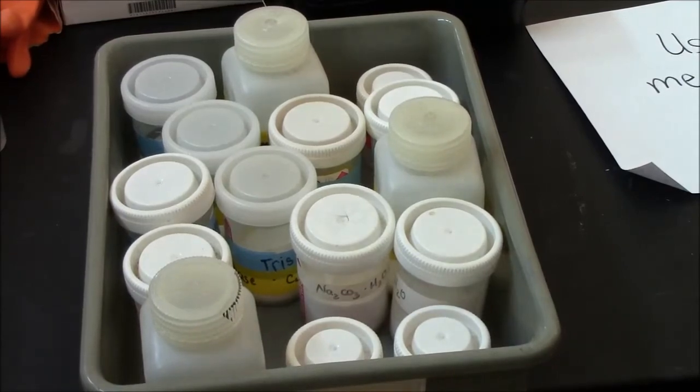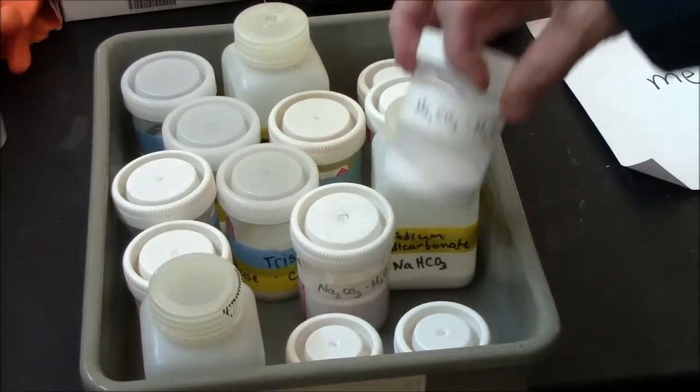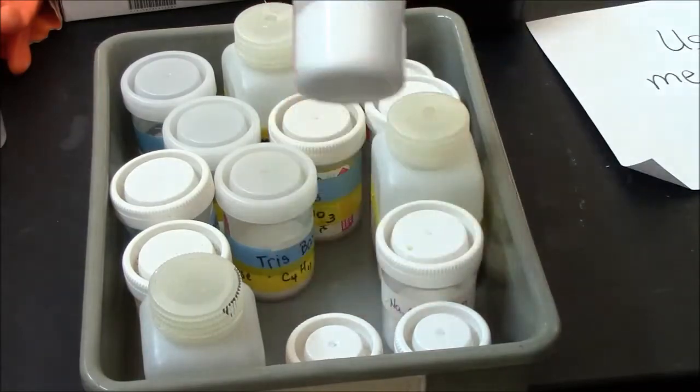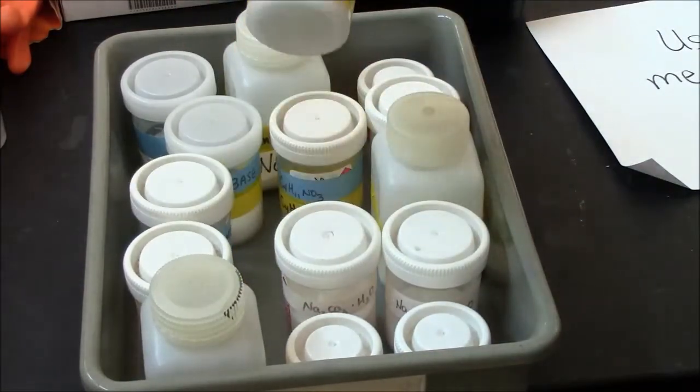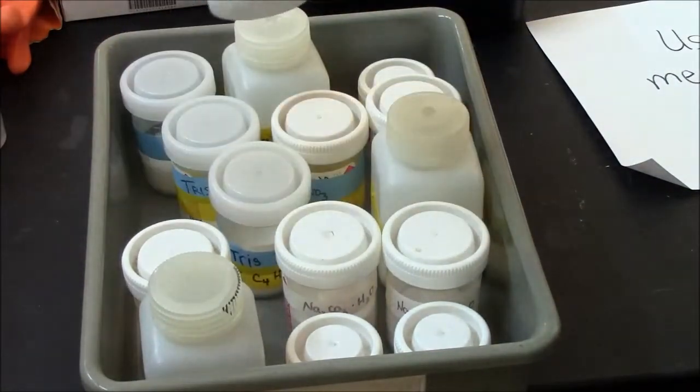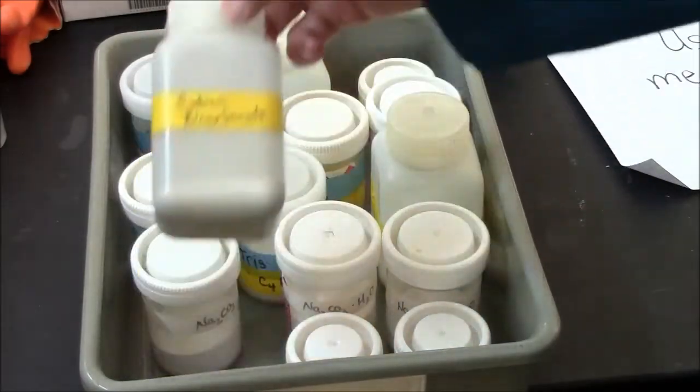When it comes time to make your buffer, I provided the buffer components in this box here. You do need to read the labels. Making the wrong choice of bottle is a very common source of error in this lab.